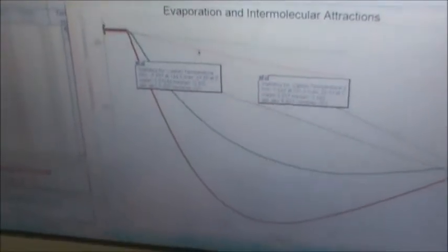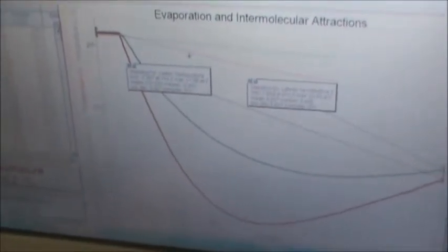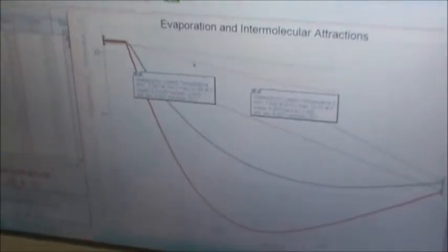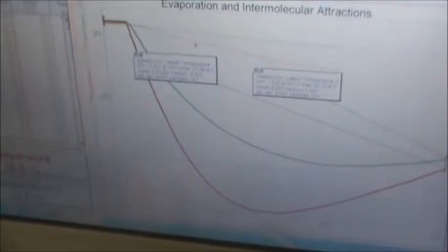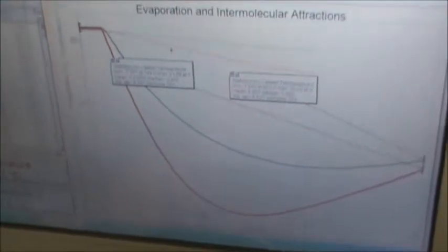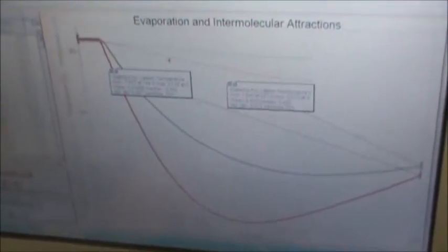After you've done that, you want to think about what is going on in this graph. Why on earth are the temperatures dropping so much? Because of the different chemicals. Think about the 3 intermolecular forces that we've discussed in class: dipole-dipole forces, London dispersion forces, as well as hydrogen bonding. Think about what all of those factor into the molecules. Think about your pre-lab table that you filled in previously, and answer the 4 questions that follow in the conclusion section on the last page.